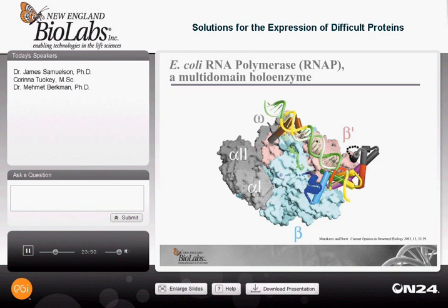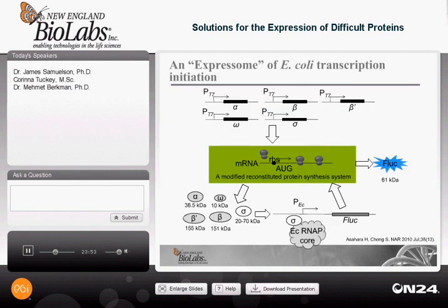My next slide is a very busy slide, just to illustrate what was put into the reaction tube for this experiment. Essentially, it's quite simple. The researchers took all of the subunits for the E. coli RNA polymerase, the alpha, beta, beta prime, omega, and the sigma factor, and put them under the control of the T7 RNA polymerase promoter. They expressed these in vitro with the PureExpress system. That's shown in the bottom left-hand corner.